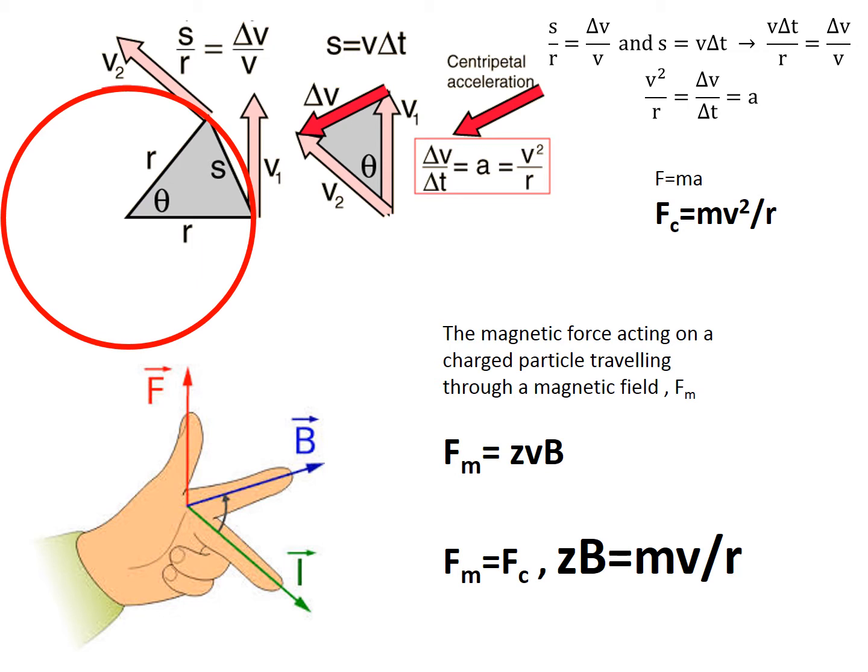Okay, so the force, well, it's actually the acceleration up there. Acceleration is just the velocity squared divided by the radius through which they're being turned. So the force acting on each mass ion is this equation.